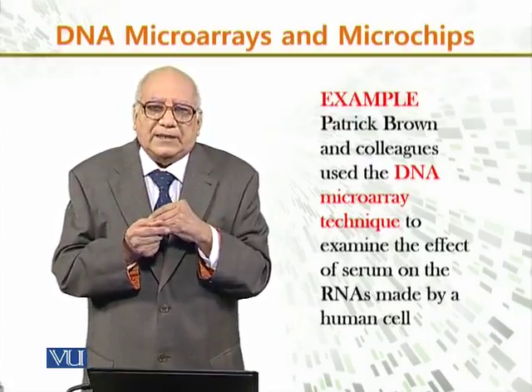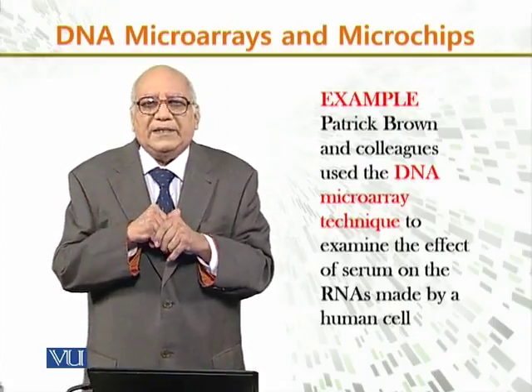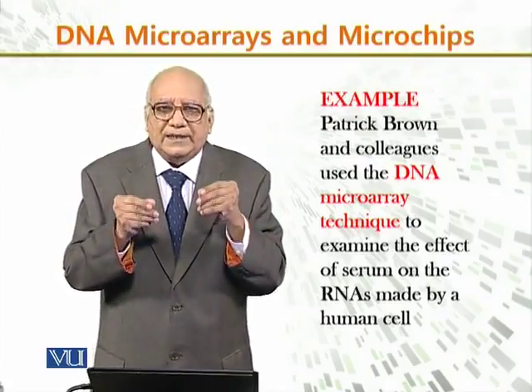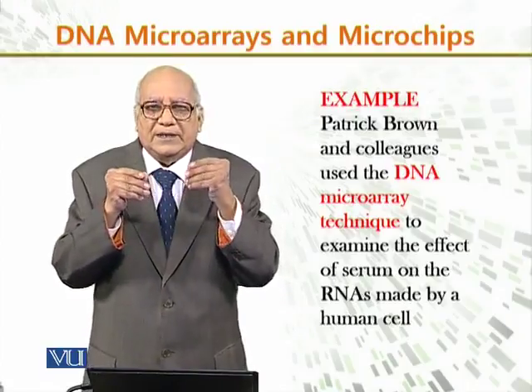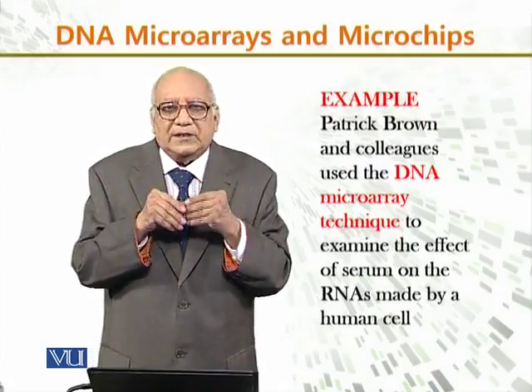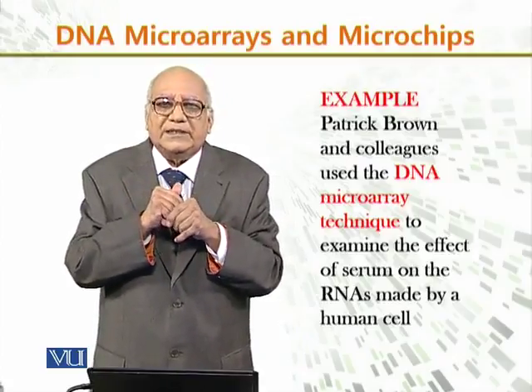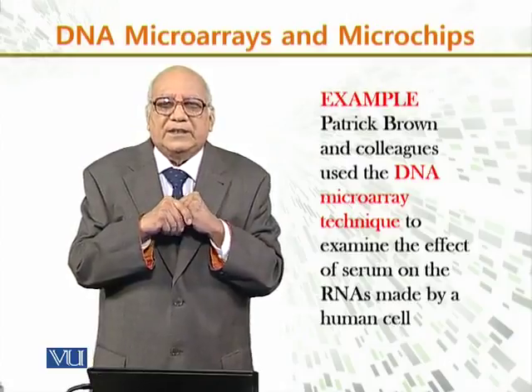Similarly, the microarray chip is used in agriculture, in medical research, and in other areas. It has given a very important and useful handle to microbiologists to analyze a large number of DNAs, and eventually the genes associated with them, in one go. This technology is very useful and economical, and is used by a large number of molecular biologists and biotechnologists in their laboratories to analyze gene sequencing.